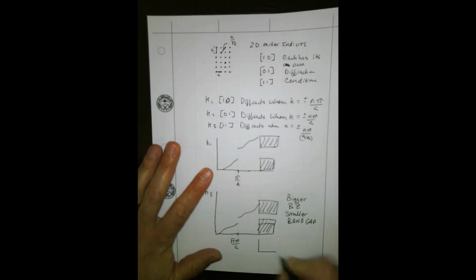So let's just say this band gap down here, and I'm kind of drawing it, is the K3, and this band gap here is the, how many did I put? I put kind of 2. The K1. And I'll show a better cartoon after this.